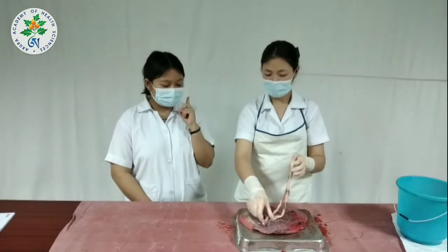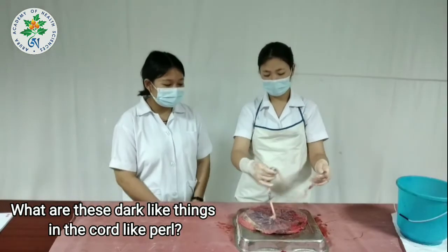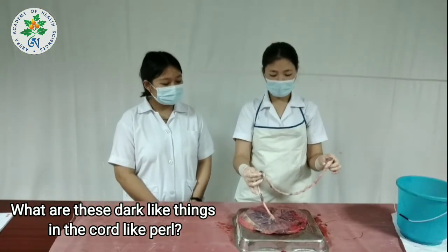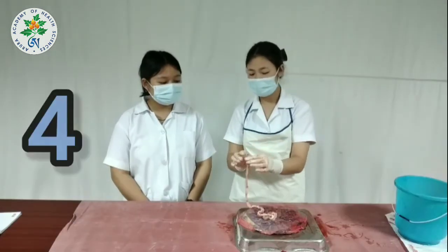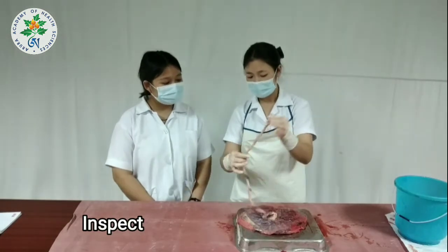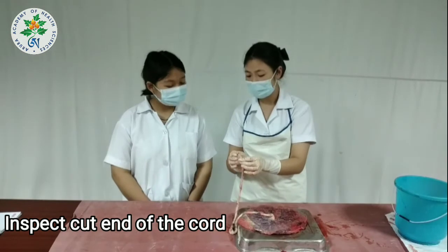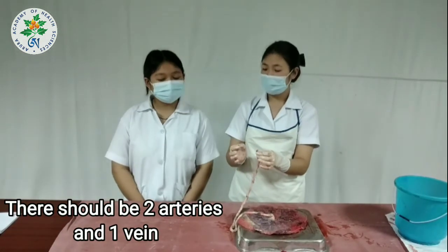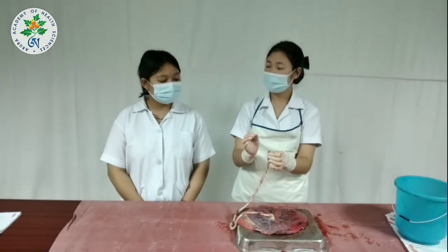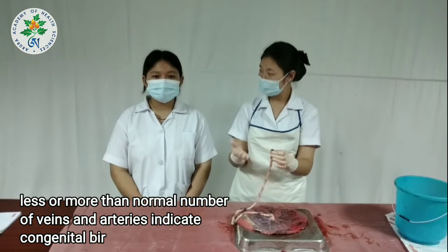We can see dark things that look like pearls hanging — these are blood clots. We will inspect the cut end of the cord. There should be two arteries and one vein. Sometimes there might be only one artery, or there can be more than two arteries.